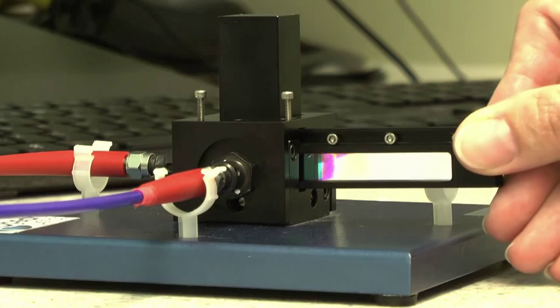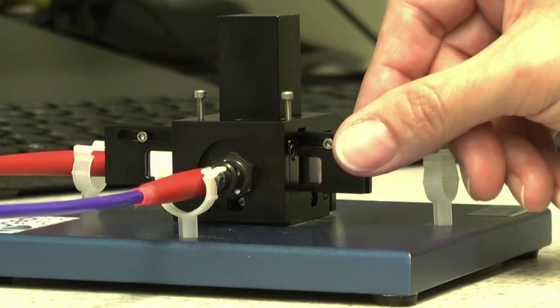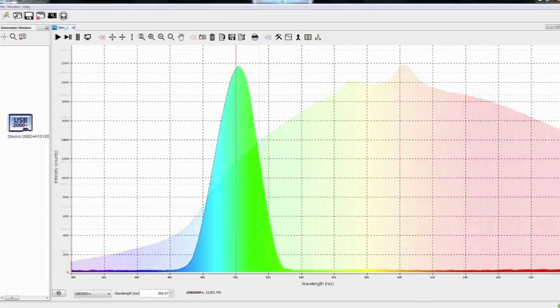As we pass the LVF filter in front of our light source, we then select different band passes of light. So we're now choosing different band passes to use for excitation.